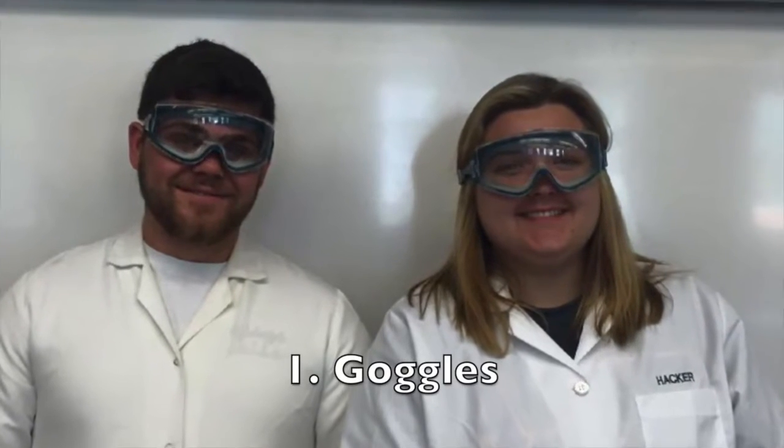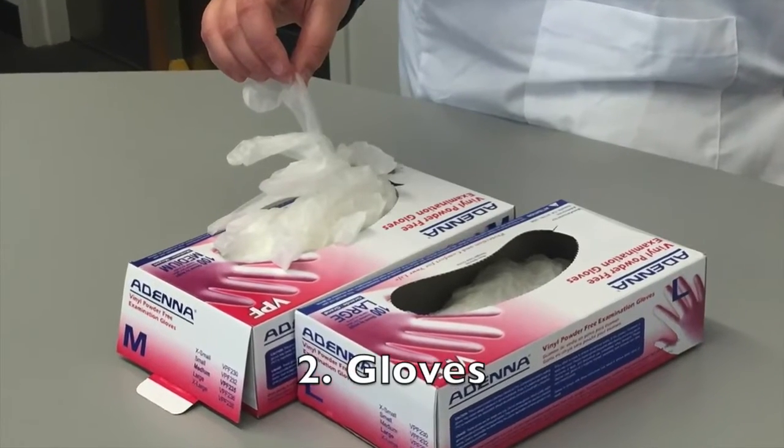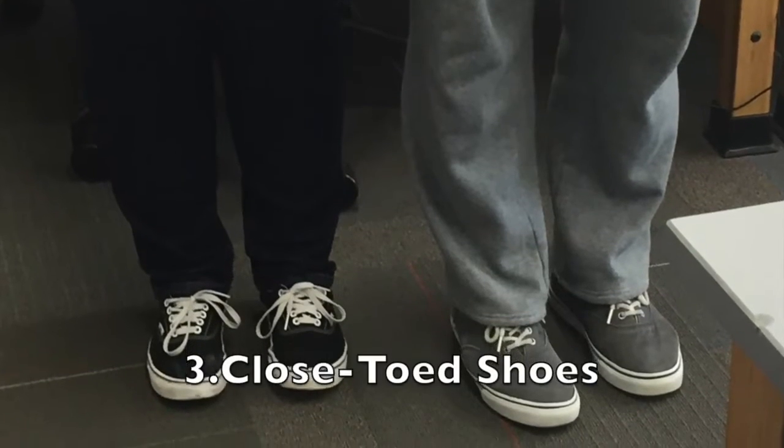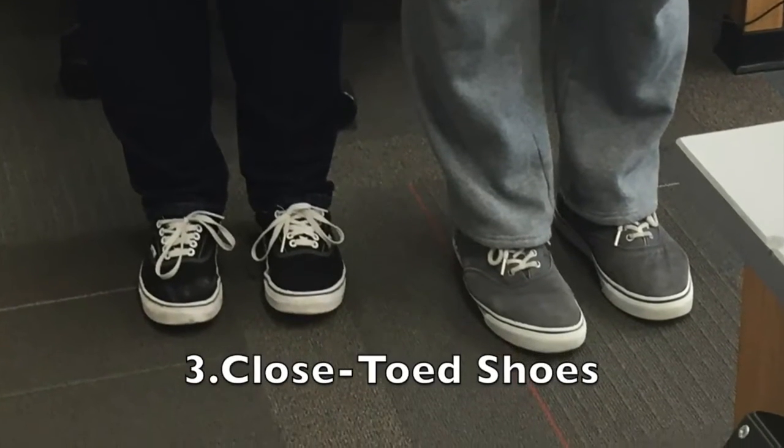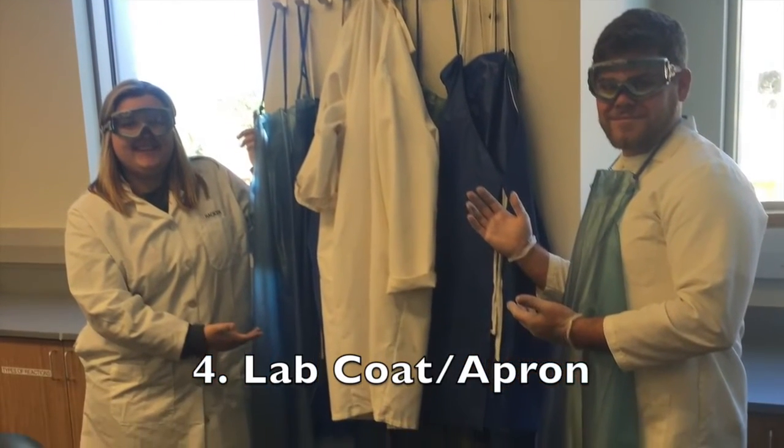Make sure that you're wearing appropriate safety goggles. Also, while working with any chemicals, it is important to wear gloves just in case anything spills on your hands. Closed-toed shoes are required while performing your laboratory techniques. Finally, the use of a lab coat or apron is optional, but always advised.